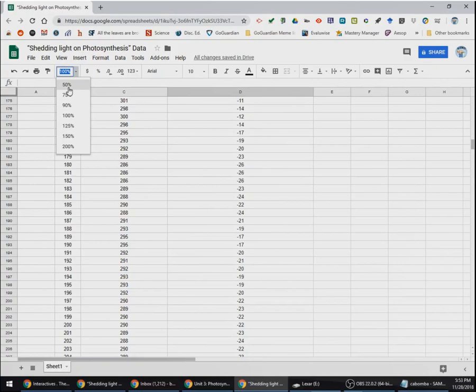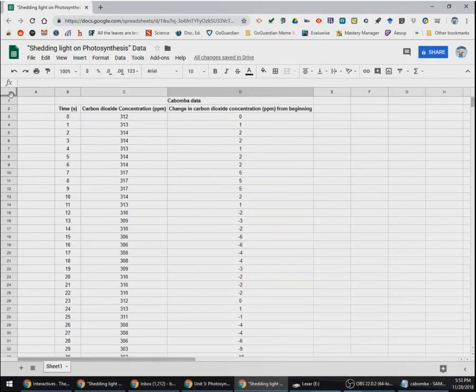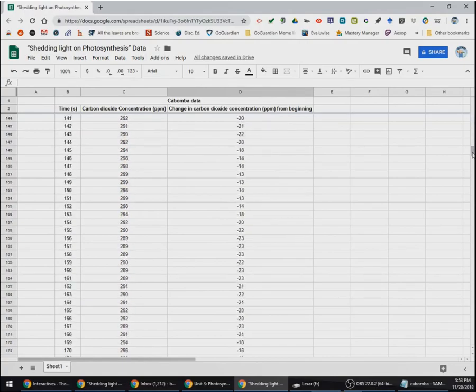One thing that might be helpful just to scroll through the data faster is to zoom out so you can run through everything a lot quicker. Another trick I want to show you, which can be really helpful, is if you notice this darker gray bar right here, if you put your mouse over it, you get a hand. I want to grab that and bring it down 1, 2. So it's right there, and this thick gray bar goes here. Now, what's going to be really cool is when I scroll, that'll stay there. So I can look at all the different numbers then.